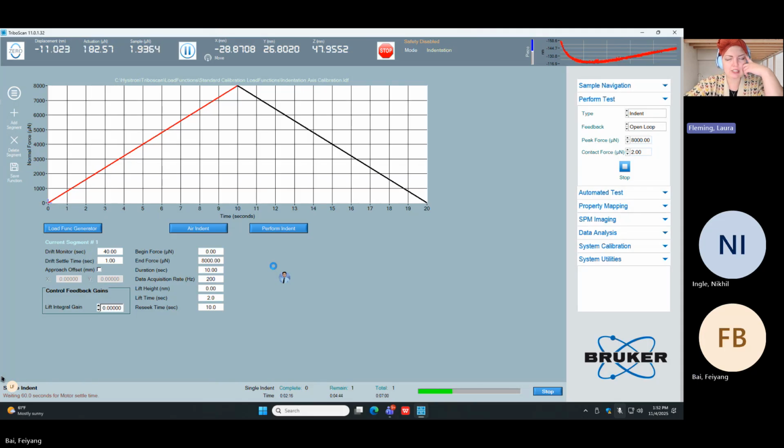It's really what we care about is constant drift, because we can apply that drift rate. The system does apply that drift rate automatically to the displacement data. So as long as our drift is constant, our drift rate is accurate, and the test results can be trusted. So now we're on to 45 seconds of piezo settle time. This is also important because you look at a test and you say, well, it takes 12 seconds, right? Loading, hold, and unloading, and it actually takes about 2.5 to 3 minutes because of all of these other things that happen.